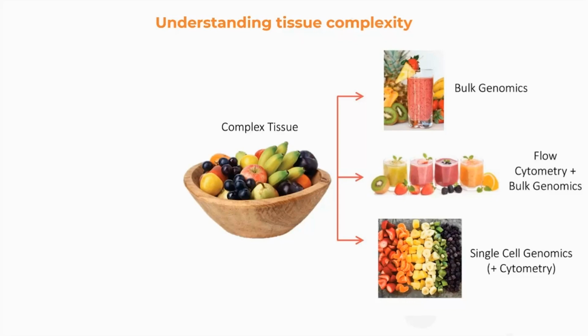In 2011, with the advent of single cell sequencing, we could order these cells. We knew how much of an individual cell type there was, but we didn't really understand where these were. We could project this onto a t-SNE and identify cell populations and so on, but we didn't really appreciate how these exist in organs and in tissues and understand the complexity of this.